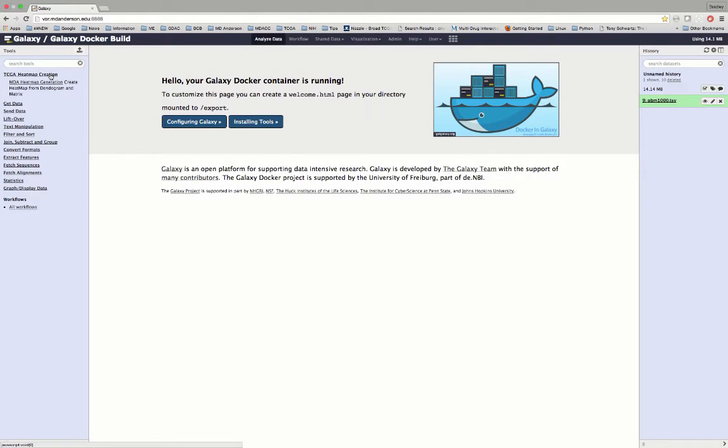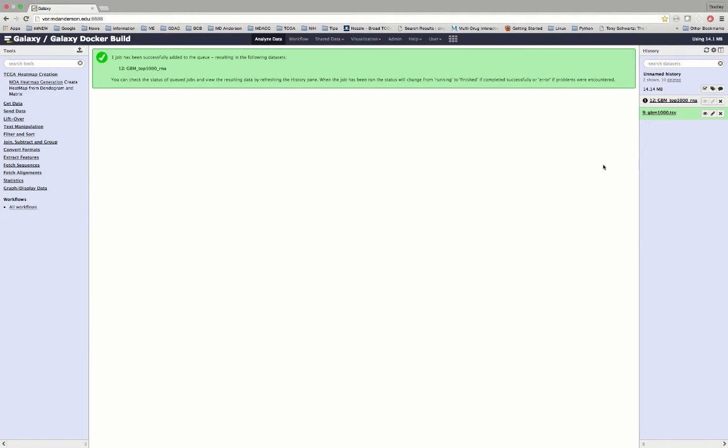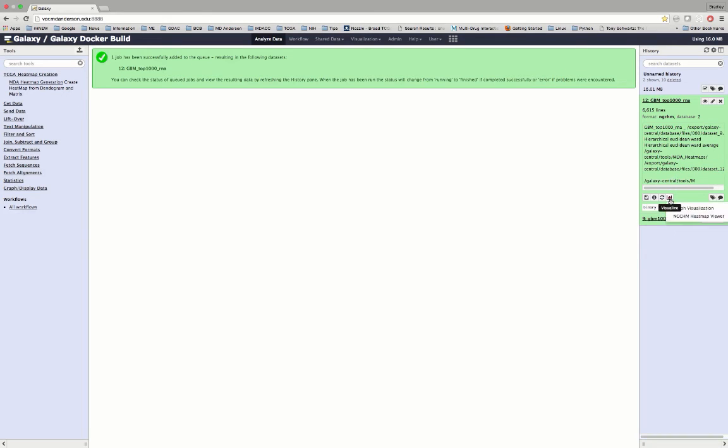We have recently created a new version of the NGCHM system that can be easily incorporated into Galaxy workflows. There is a Galaxy version of our NGCHM Builder tool. I am demonstrating that here using a data matrix that I have previously loaded into Galaxy. I will set an appropriate name for the NGCHM. After I'm satisfied with the settings, I'll go down to the bottom of the tool and start building the NGCHM. After the NGCHM has been built, I can visualize it using our NGCHM visualization tool and display a copy of the NGCHM right within the Galaxy environment.